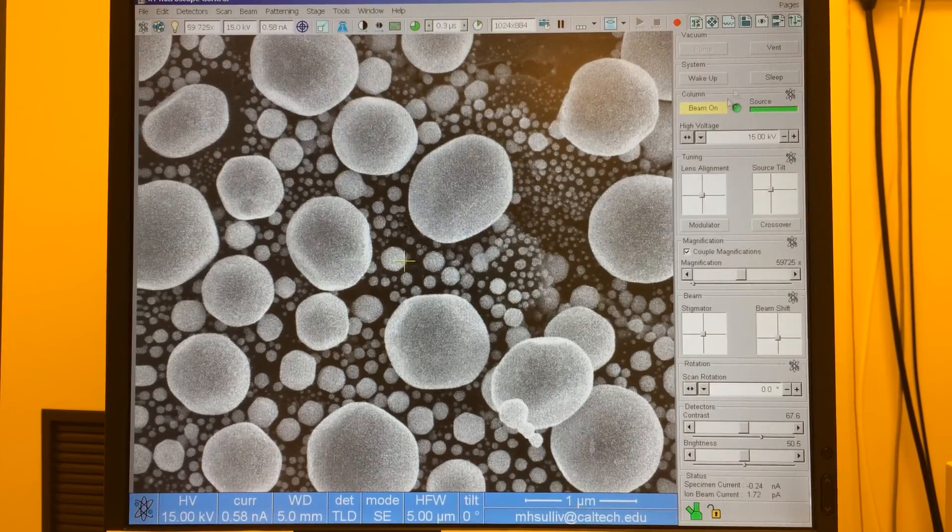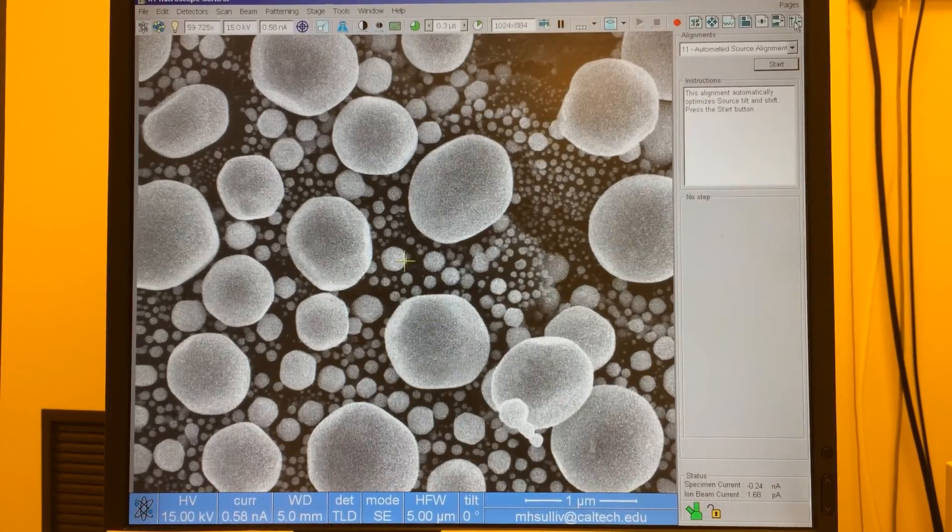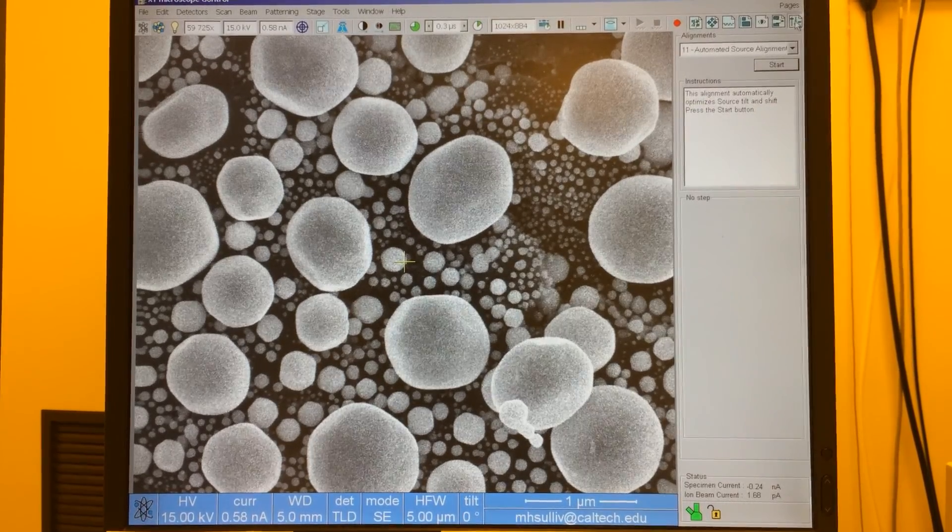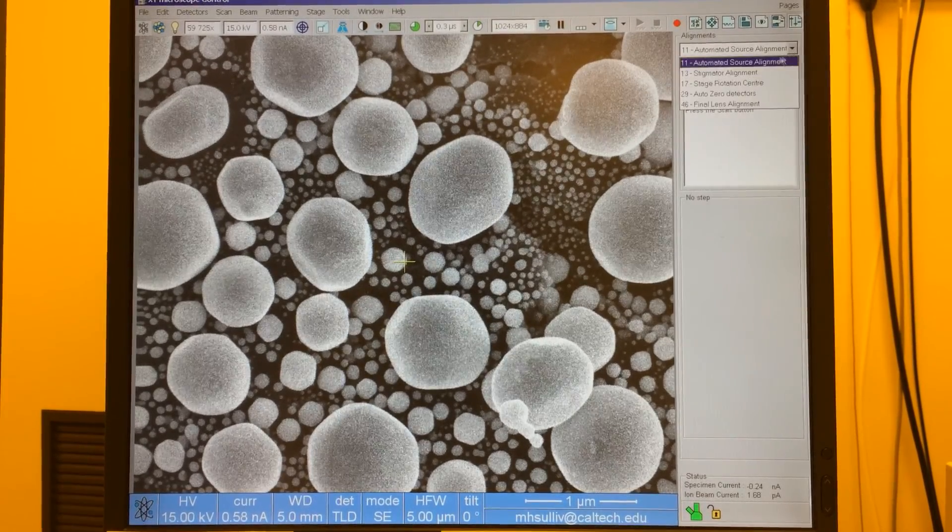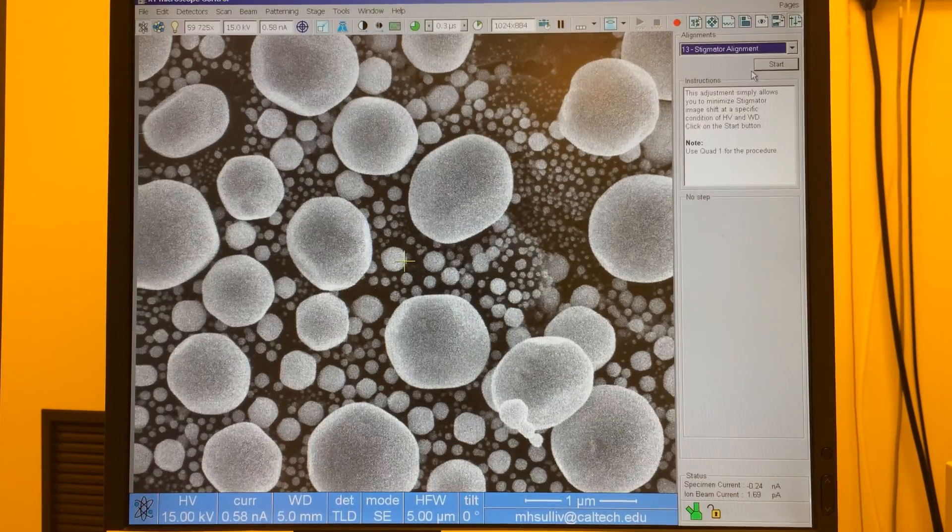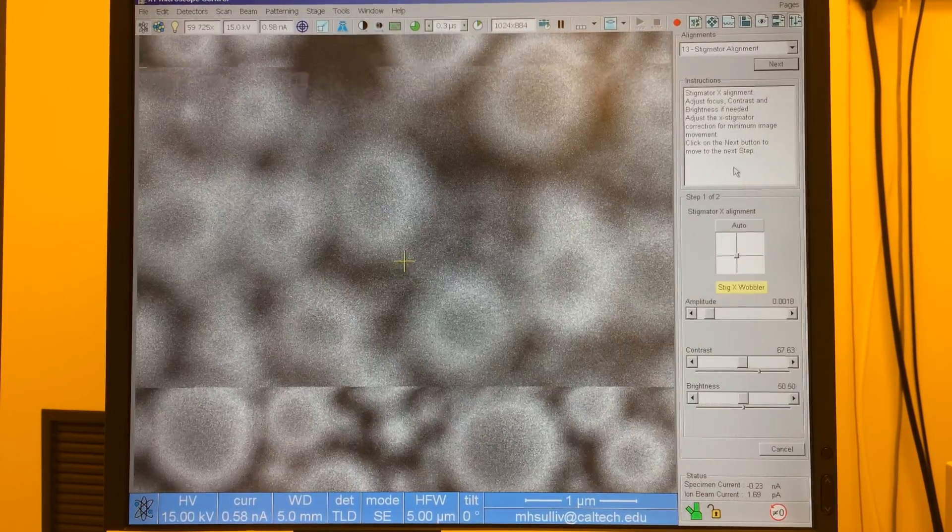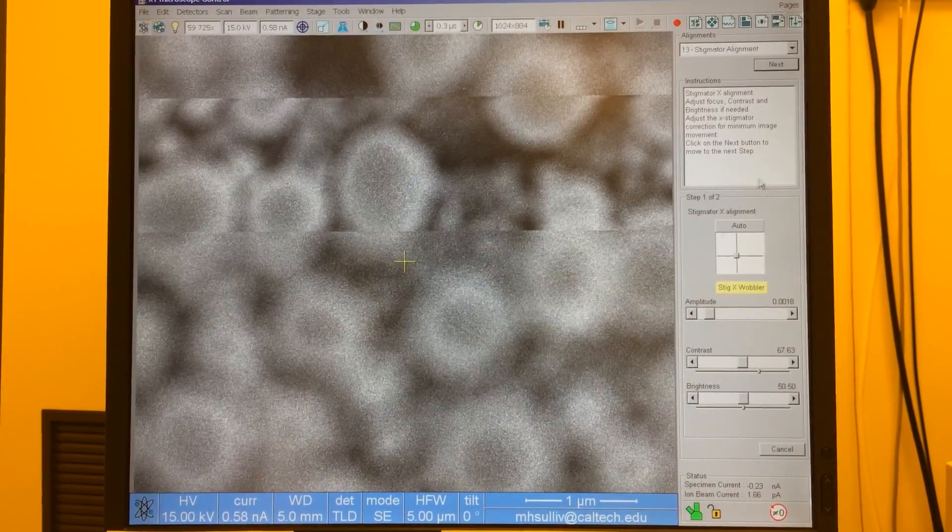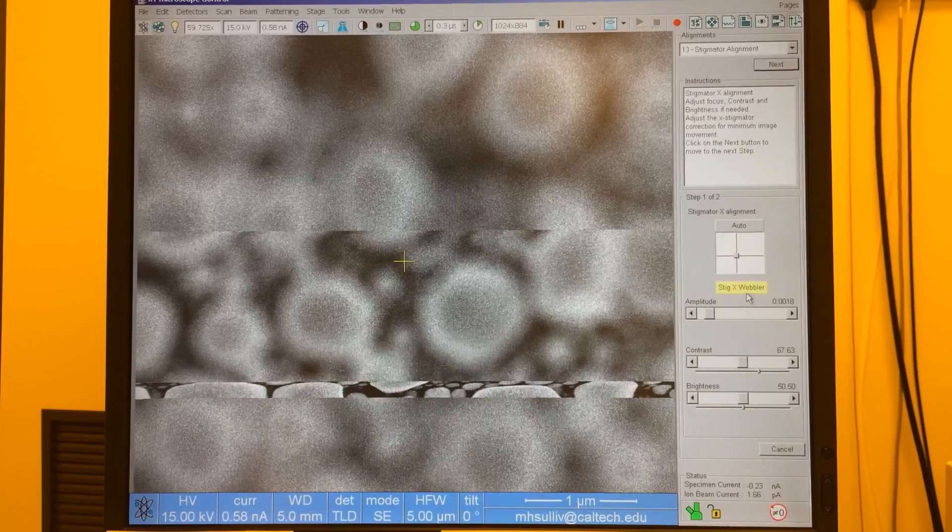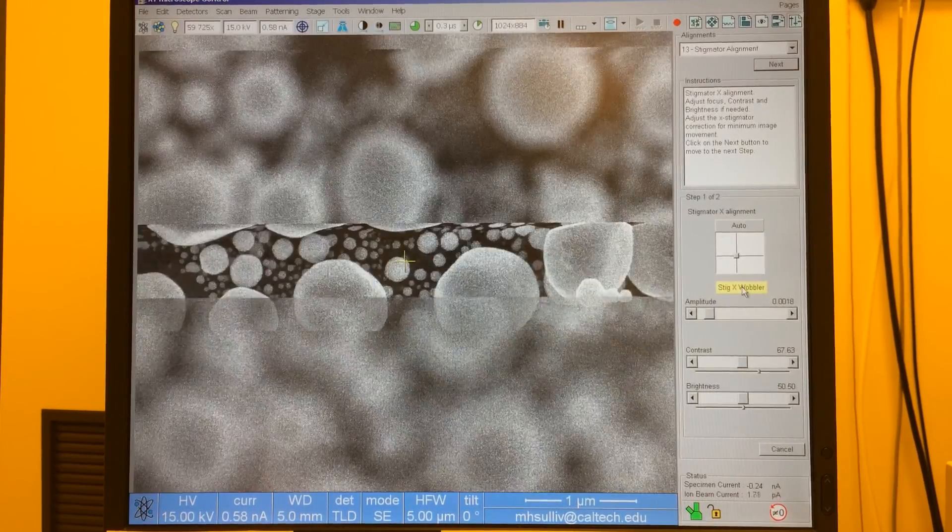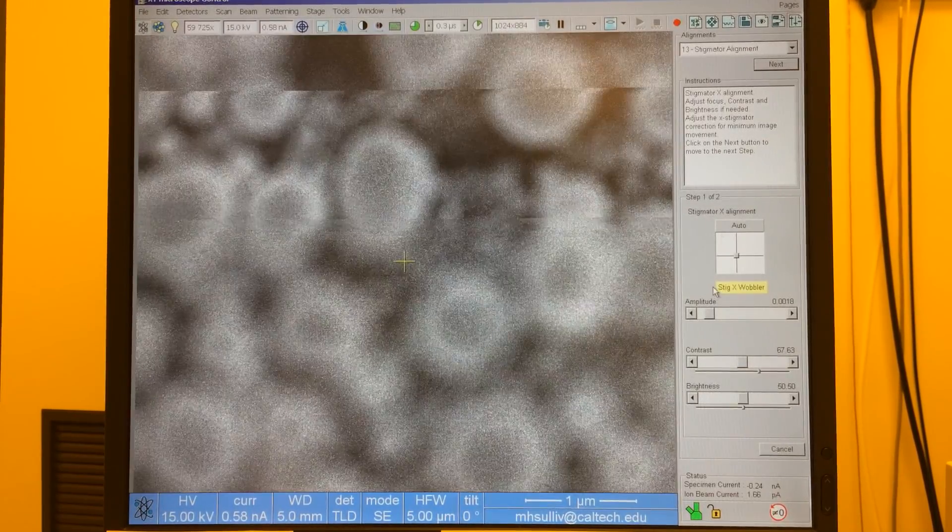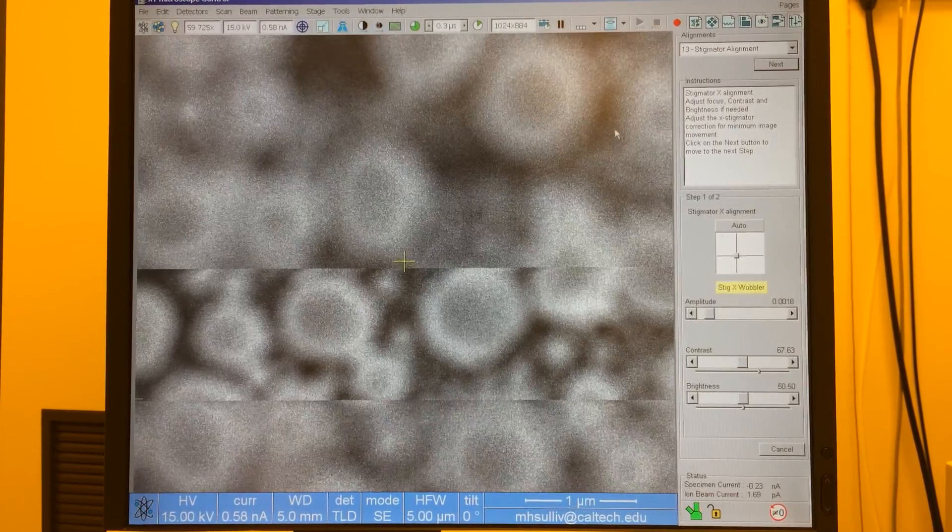So in order to do that we go to our alignment page here at the top right and we want to select stigmator alignment. We'll press start and this will guide us through the process. What it's going to do is wobble the x astigmatism much like when we do lens alignment it wobbles the focus.